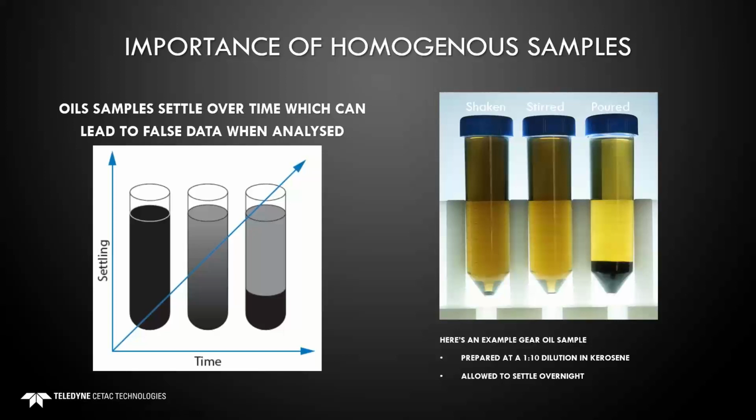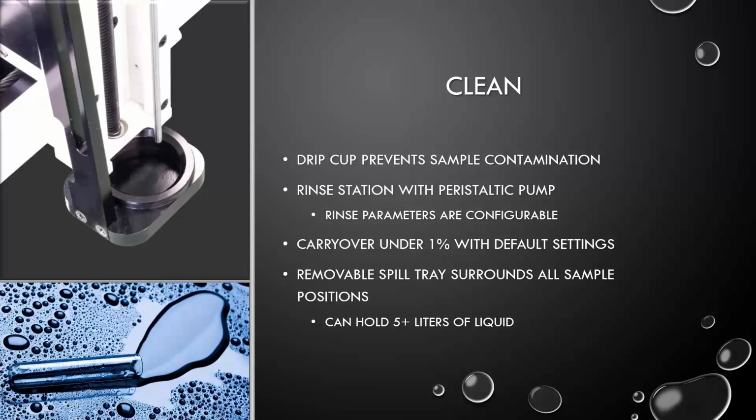But that sample that's poured is definitely, out of the 3, going to be the problem. And the sort of mixing that you'd normally do prior to sample introduction may not be sufficient for something that's settled to that degree. So it's also important to make sure that you get your samples well mixed when you prepare them, and then also that you refresh them for best quality data.